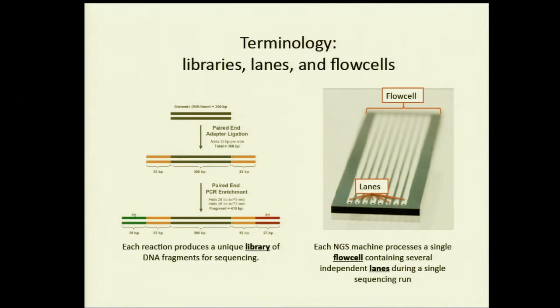And that actually happened at the Sanger recently, where they turned off the machine and then turned it back on, and the machine forgot that it had actually incorporated a base and reincorporated it again. So every single read that got sequenced on this particular flow cell had an extra base at the exact same cycle. And this is the type of error that we'll try to capture in the GATK before we look for mutation variant detection downstream.